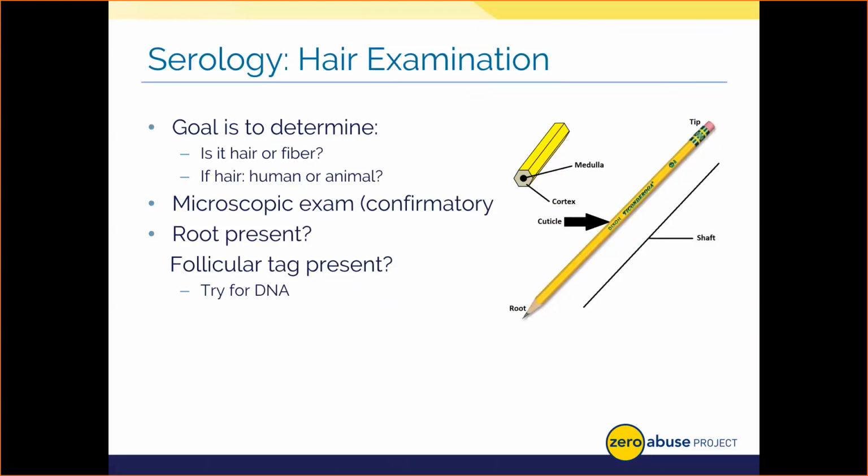The medulla in humans is classified as either amorphous, meaning it kind of looks like a solid or broken line like pencil lead, or it can actually be totally absent, like a pencil with no lead. We also investigate how thick, if present, the medulla is by using what's known as the medullary index. A medullary index of equal to or less than 1/3 of the shaft diameter, in other words, the medulla is pretty small, is indicative of human hair. In short, the medulla is very small inside of the hair shaft of humans.